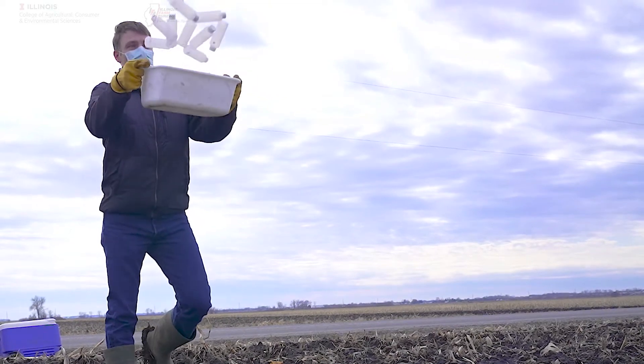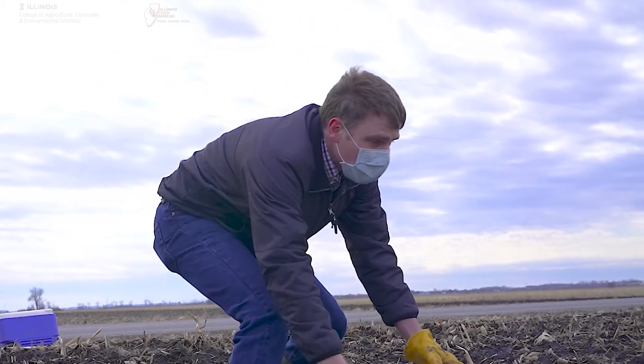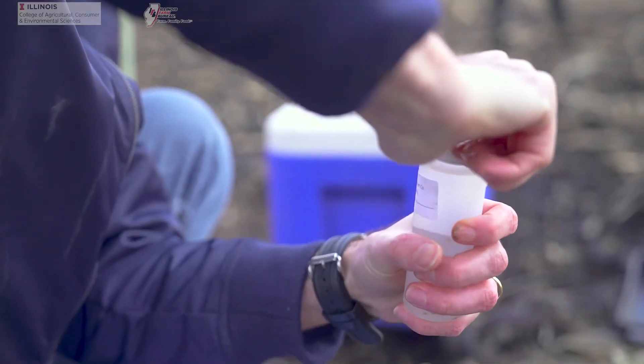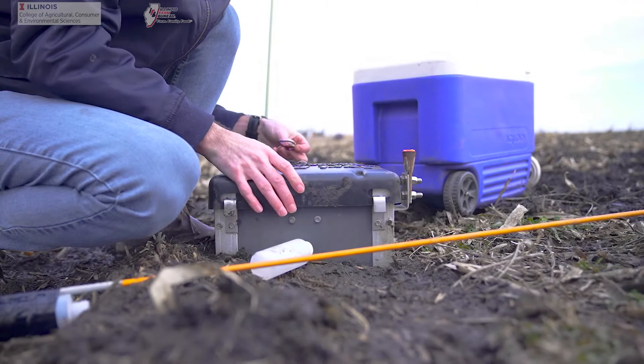We recommend that the bottles are pre-labeled because that minimizes the possibility of mixed up samples in the field. Cap the bottle tightly, again verifying the label. Close the control structure lid and secure it.